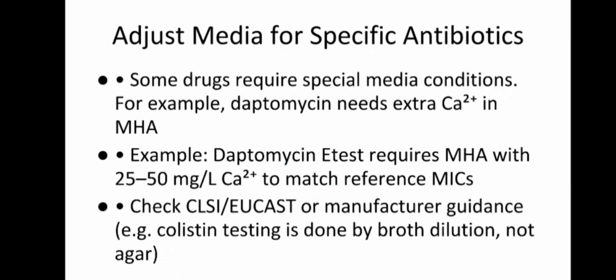Basically, it will undergo a conformational change in the presence of calcium, which enables the bactericidal activity of daptomycin towards a microorganism. So, starting with this case, you have to keep in mind the special conditions required by the antibiotics to have an antimicrobial effect.